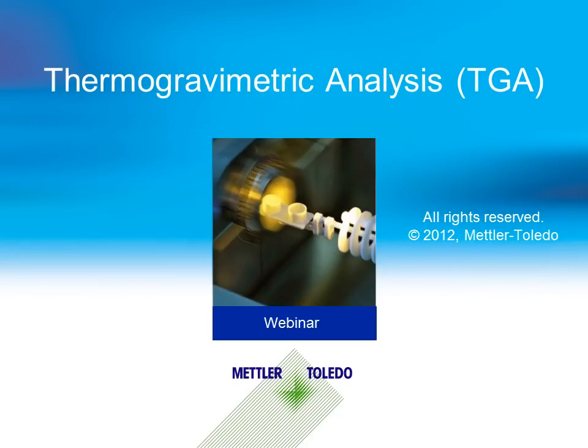The properties and behavior that can be measured by TGA include composition, purity, decomposition reactions, decomposition temperatures, and absorbed moisture content. TGA is often used together with differential scanning calorimetry, DSC, because the two techniques provide complementary information which often facilitates the interpretation of a thermal analysis experiment.